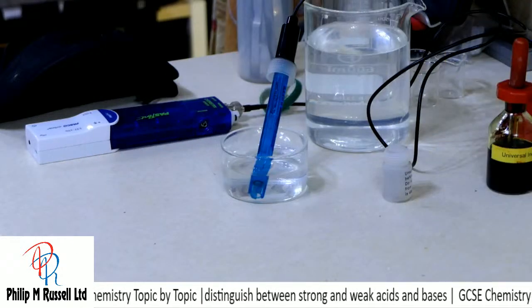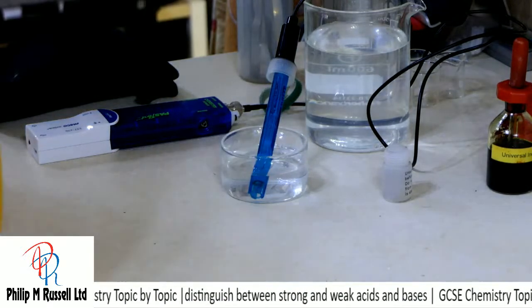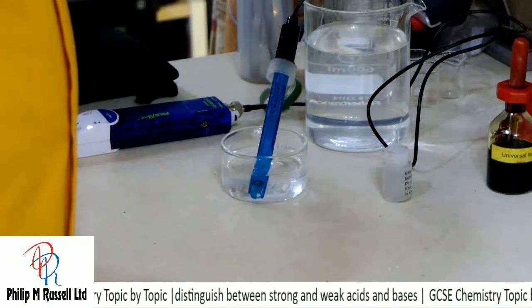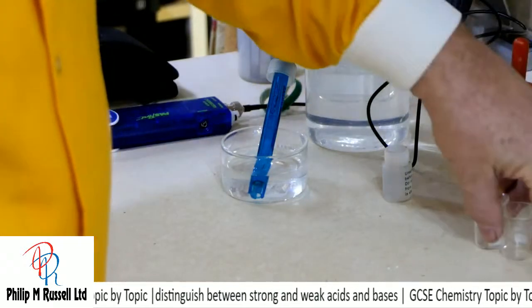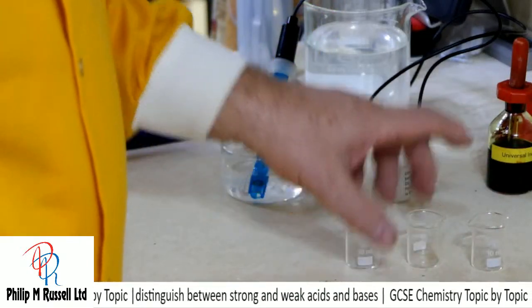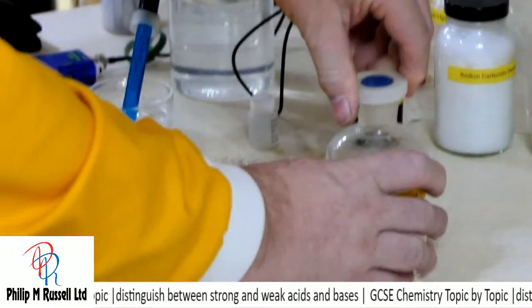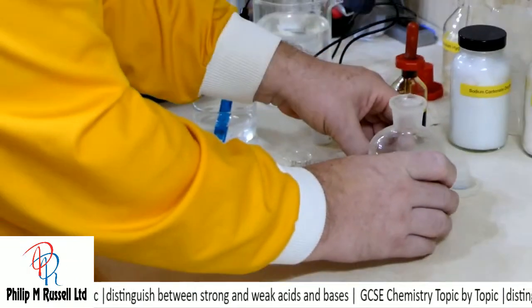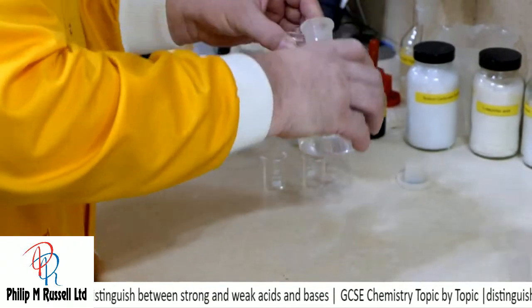Okay, let's try a small amount of some of these acids and see what happens. So let's take my 1 molar hydrochloric acid, and I'm going to put a little bit in there.